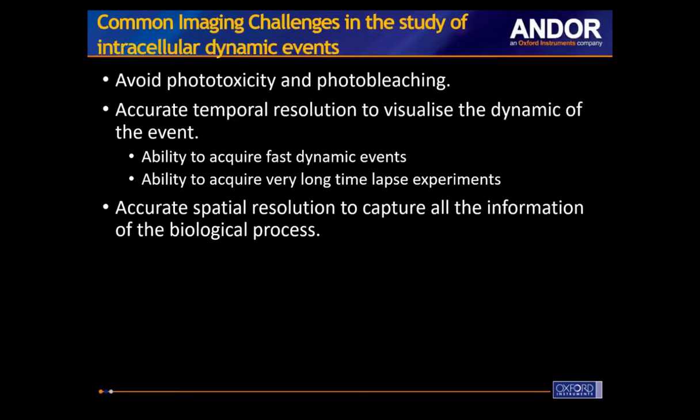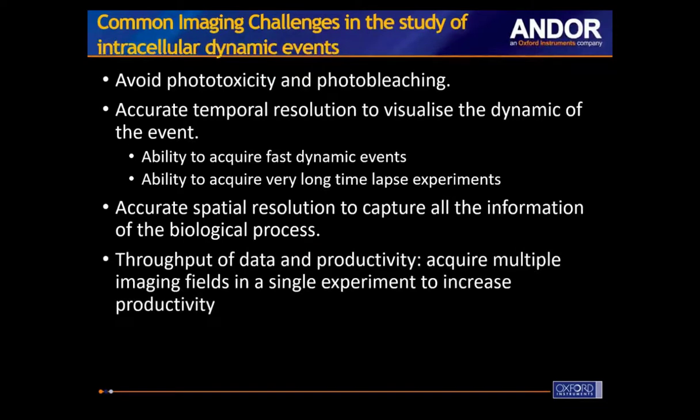Also, accurate spatial resolution is needed to capture all the information of the biological process, and sometimes live cell super resolution is also required. For throughput, to increase productivity, researchers benefit from being able to image multiple imaging fields in a single experiment, to have more data to analyze and make their experiments statistically significant.